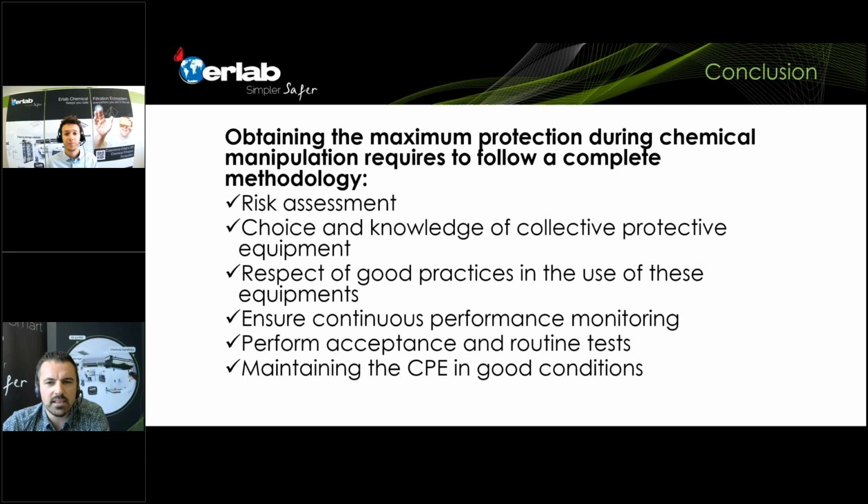So I think this answer did also answer one question from Rachel Parkin, because you asked how long does a ductless fume hood filter last if being used for 4 hours per day. So this is not possible, as Moraine told you, to give you this answer without performing a risk assessment, because we also have to know which kind of product you are going to use for 4 hours per day, and the exposure time is not going to be the only parameter we are going to take into account to do the risk assessment.